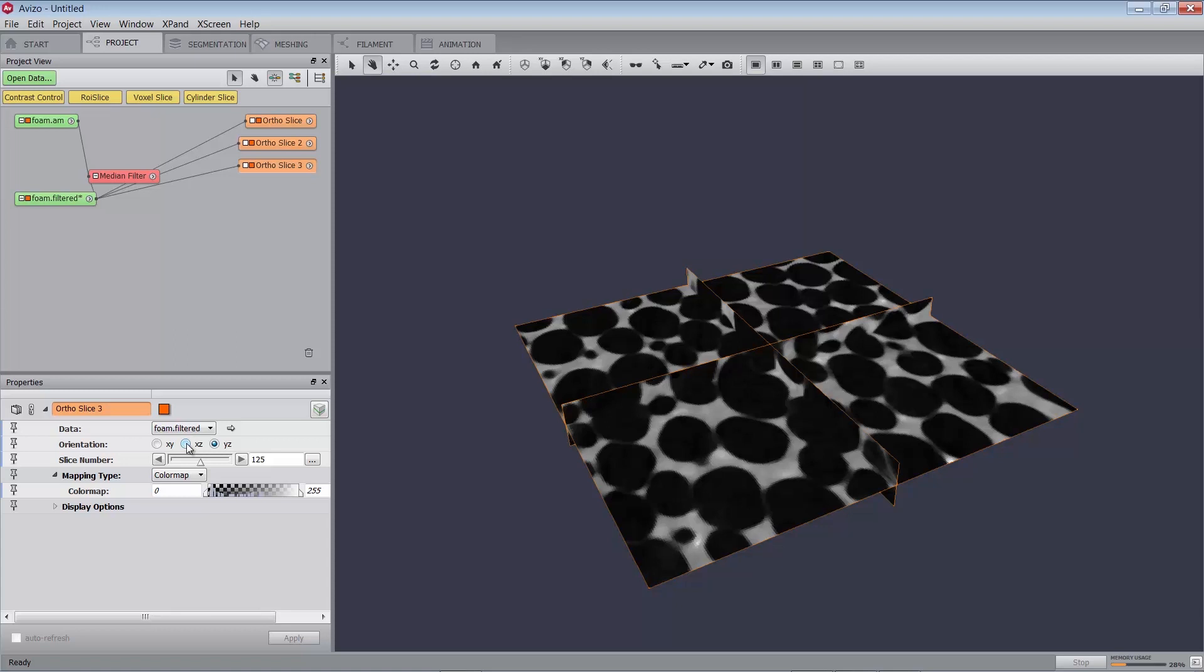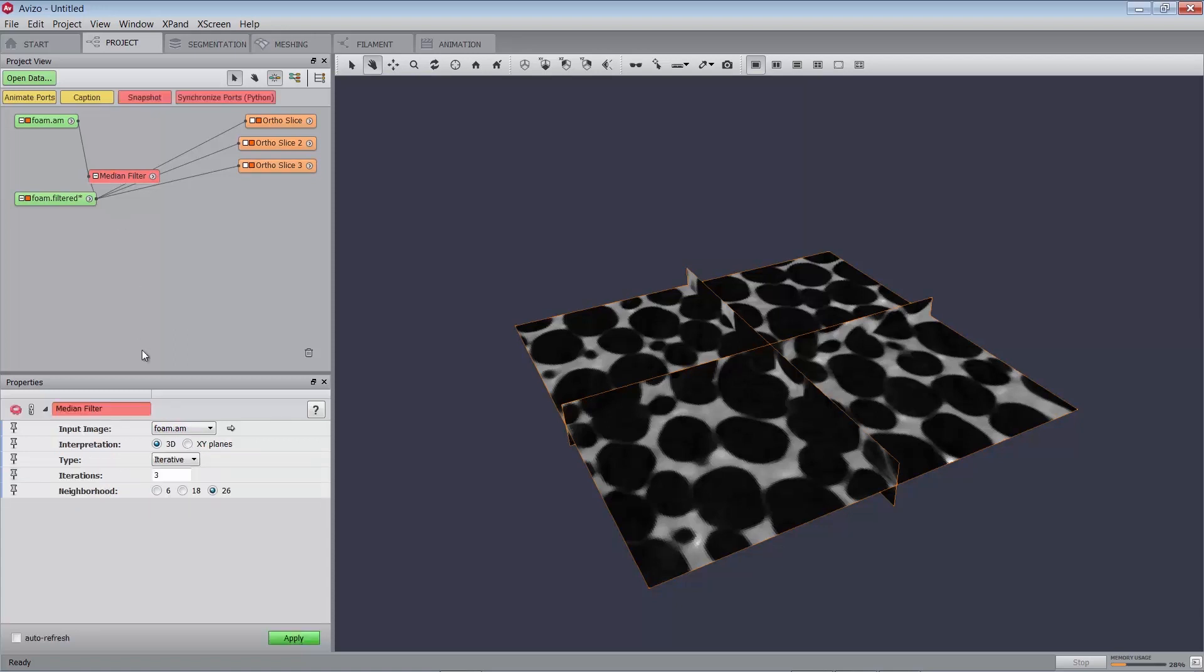In many Amira and Aviso modules, an interpretation port shows the state of the current module, that is XY planes or 3D, such as in the median filters module right here. If the state of the port is XY planes, it means that the module will perform on each XY slice. If the state of the port is 3D, it means that the module will perform on the entire three-dimensional image all at once. In some cases, the interpretation port cannot be changed. It's grayed out. For instance, when processing can only be done in XY planes.